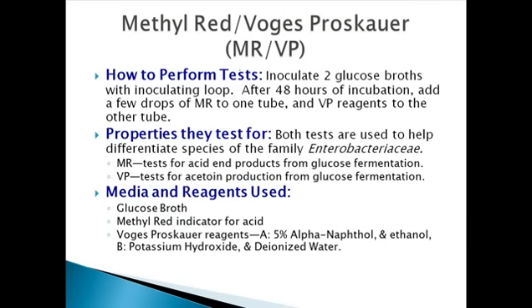The question can arise: in the first reaction we determine whether it is E. coli or a Klebsiella species, so why are we going into another step of reactions? Because many times this type of reaction can give us a false positive or a false negative, and that will make trouble for us. That's why we need to be more and more certain. So let's do some more experiments.